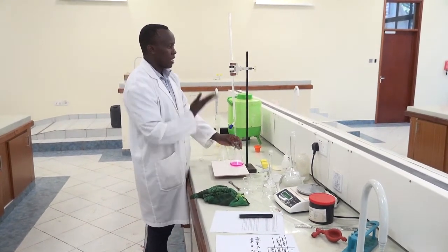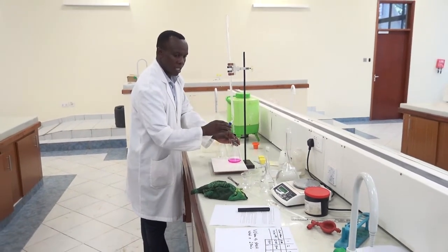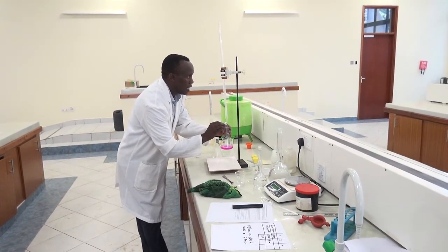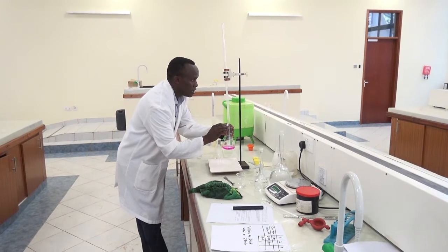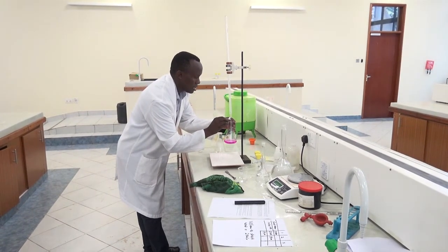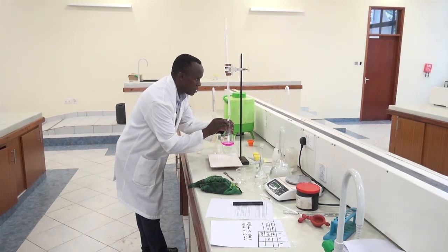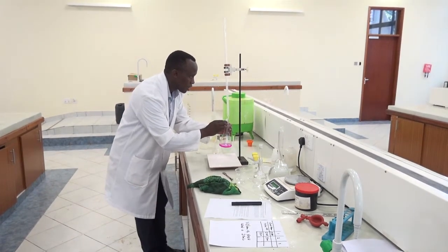So from 19, if you add 15 units there, you'll have around 34. So I'll run my burette up to around 33 continuously, because I have now approximated the endpoint. I've run 15 mils continuously, which has saved me time.